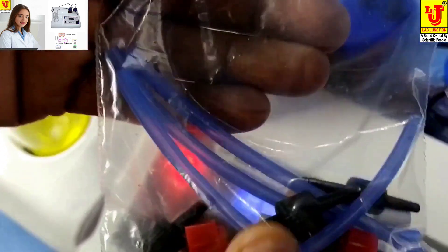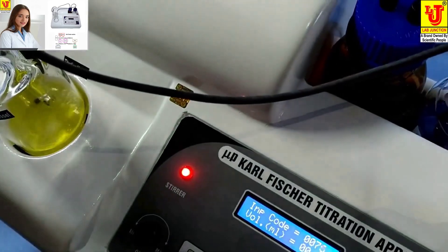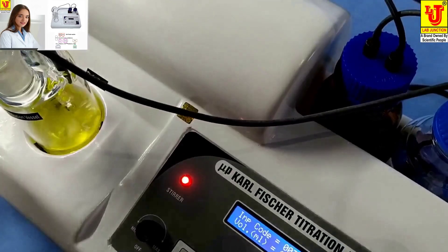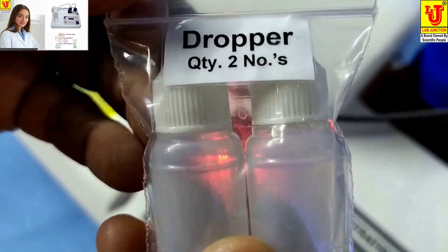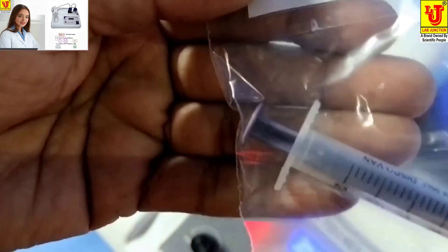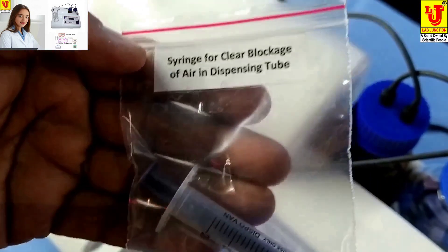Extra spares include: a Dispensing Tube with Connectors, Reagent 2 extra for future use, two Droppers, and a Syringe for clearing blockage of air in the Dispensing Tube of the Peristaltic Pump.